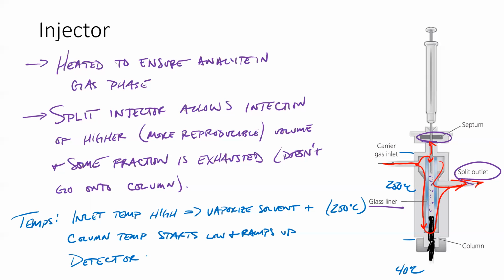And so the detector temp needs to also stay high. So high enough to prevent recondensation. Okay.